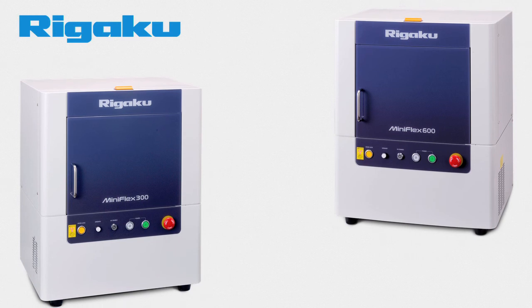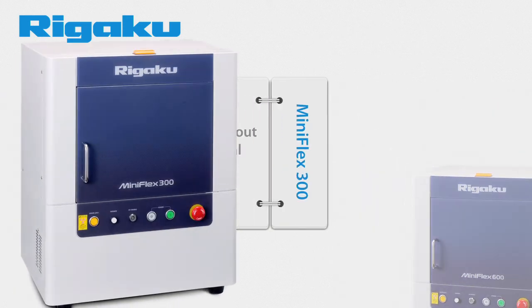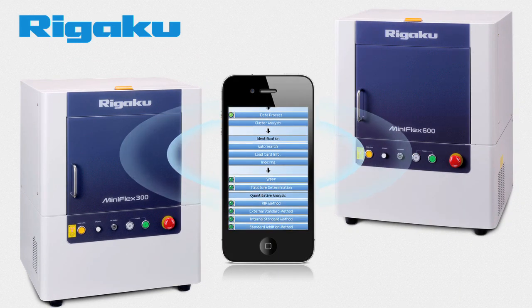In addition, the new MiniFlex comes in two models. The MiniFlex 600 has a 33% boost in power over the previous model, making data collection even faster than before. The MiniFlex 300 is designed to work without the need for an external water chiller, a feature that benefits mobile and remote lab setups.